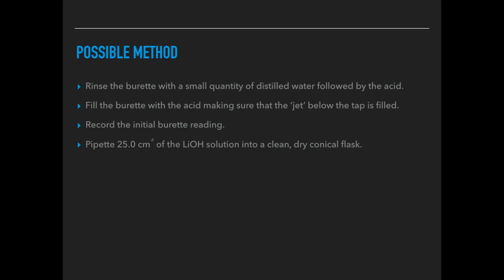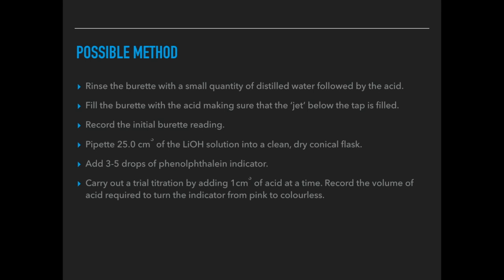Then you would move to the lithium hydroxide solution and you would pipette 25 cm³ of that standard solution into a clean, dry conical flask. Add 3 to 5 drops of indicator, and I'm choosing phenolphthalein in this case. Remember at the end of the video I'm going to explain why you would choose that indicator over others. You'd then carry out your trial titration. In the trial titration you'd add a cm³ of acid at a time and you would record the volume of acid required to turn the indicator from pink—phenolphthalein is pink in alkali, colourless in acid—so you're looking for that pink to colourless colour change.